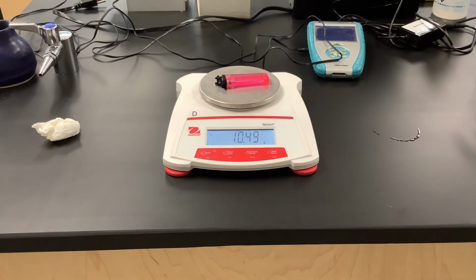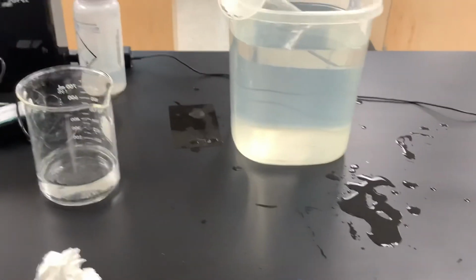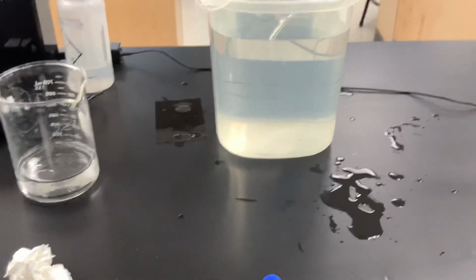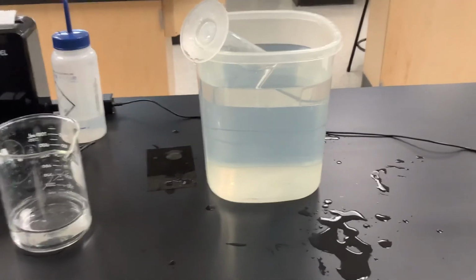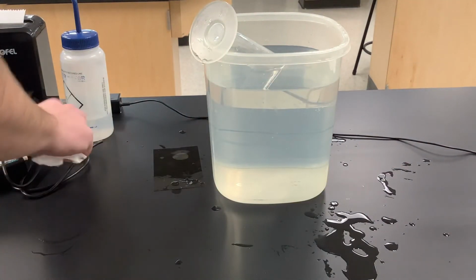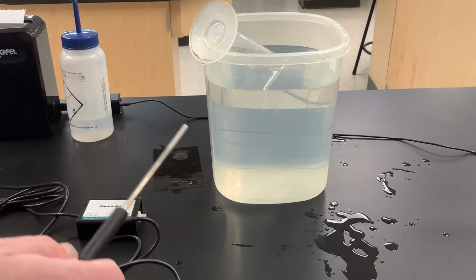Okay, so at this point we have the final mass of the lighter. And so we're able to subtract those two to figure out the grams that were used. Now there's a couple more pieces of information that we need before we move on, and that is some temperatures. So if we look back at our cylinder here, we know that the gas that we collected was bubbled through water. And so the temperature of our gas is going to be pretty much the same as the temperature of the water itself. And so we actually have two measurements that we need to take.